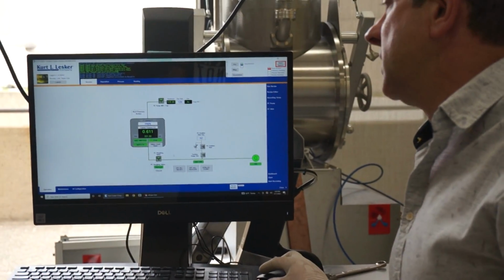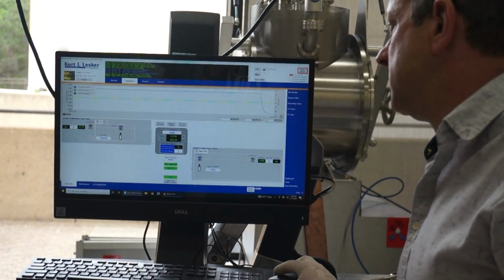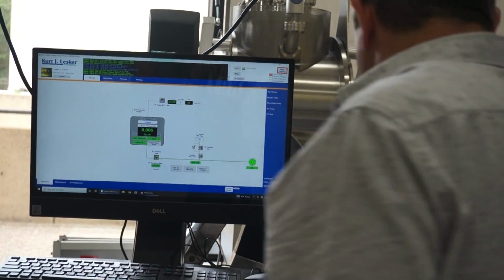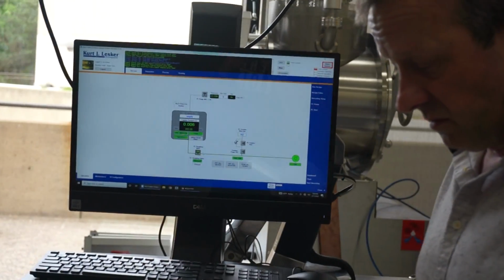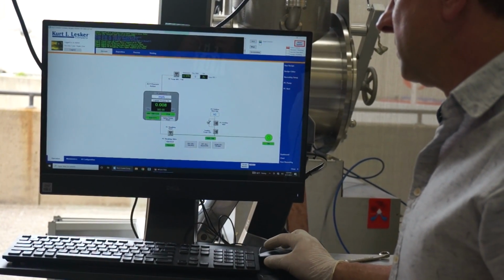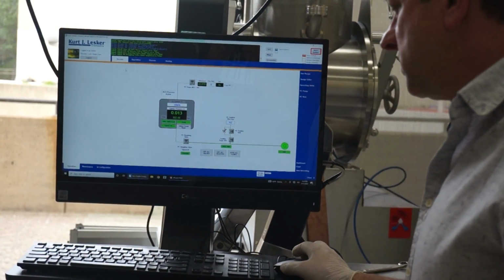So I'm going to do the rate of rise where zero all flows, off all valves. I'm going to come here, I'm going to open the ALD valve. And then I'm going to do the timer. Step back, make sure it's still open. How about now?